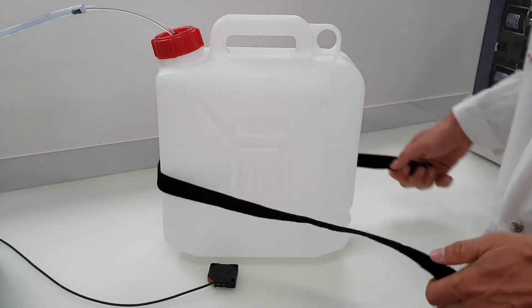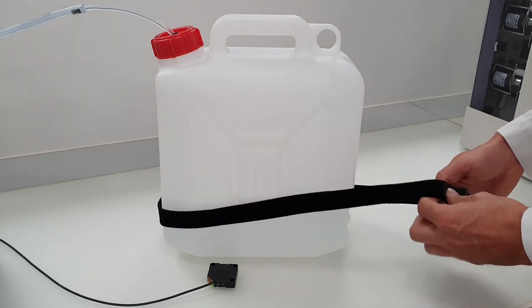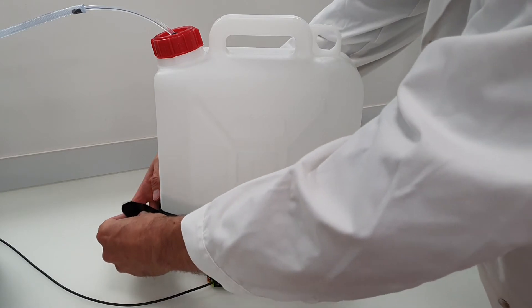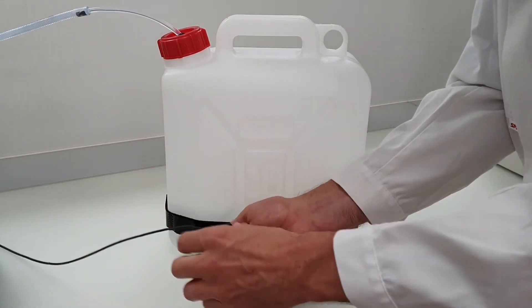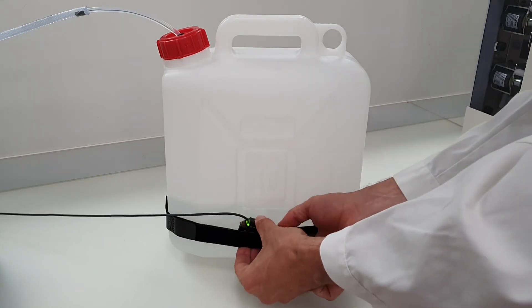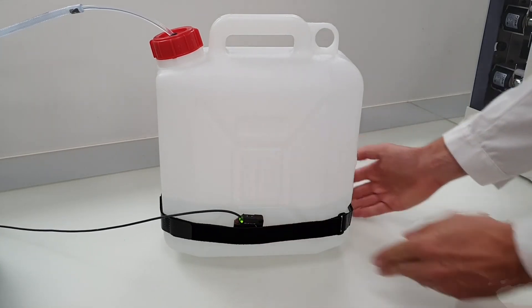The strap can be attached to any canister and the tank level sensor is placed at a low position to detect if the level becomes critically low. It can also be equipped with waste canisters to inform the user if the waste canister is full, to prevent a potential waste overflow.